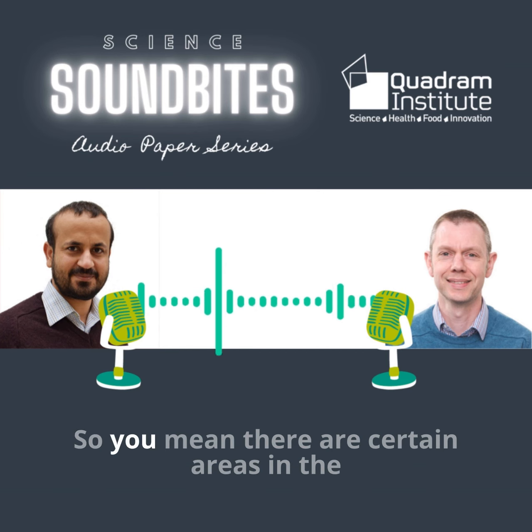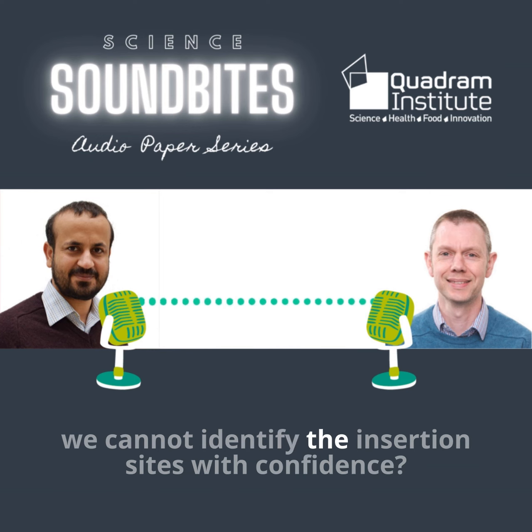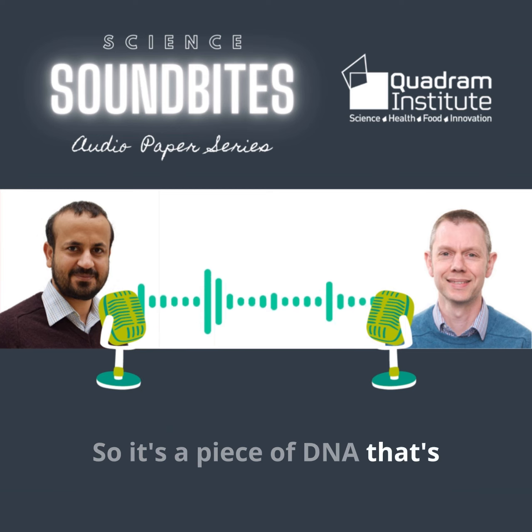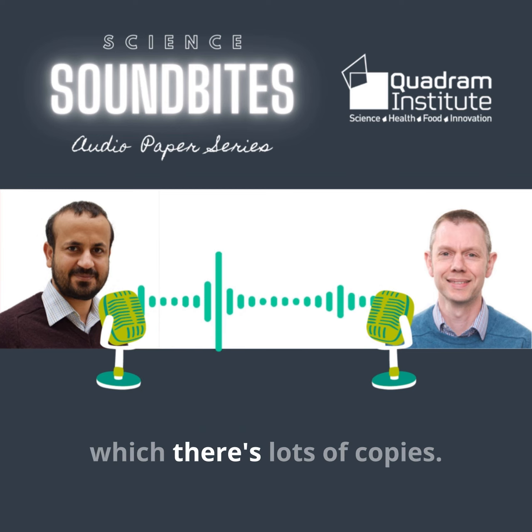Right. So you mean there are certain areas in the genome where the short read sequencing doesn't work, or we cannot identify the insertion sites with confidence? Exactly that. So about 10% of most bacterial genomes are what we call a repetitive element. So it's a piece of DNA that's somewhere else in the genome as well. So that might be a ribosomal operon, where there are lots of copies.